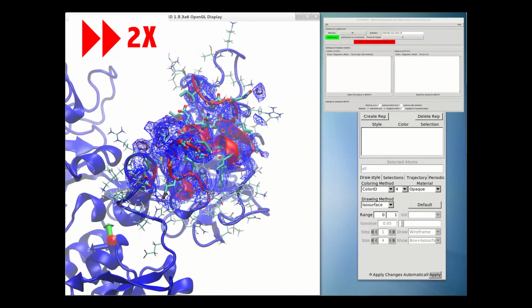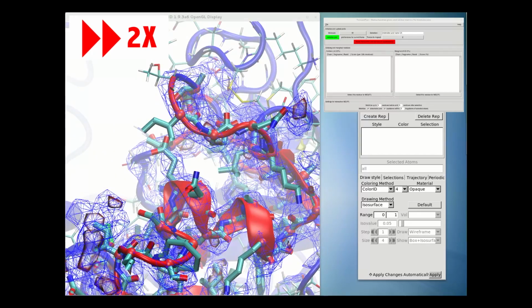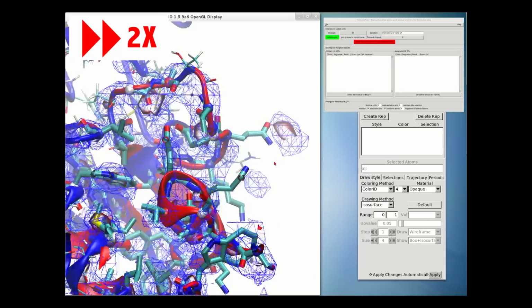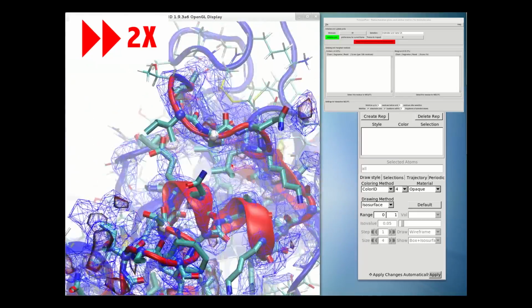My core philosophy in the design of this package is to do away with simple rigid body motions as much as possible, to make the modelling experience feel as close as possible to working with a real-world physical object.